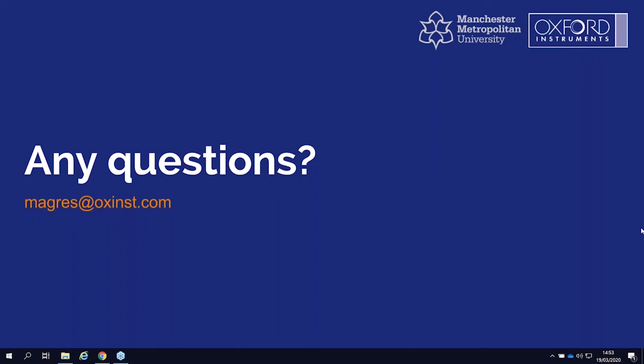So in order to give Daniel a full answer to his question, I don't actually know. I've only gone up as high as 10 mil per minute. I don't really know what the limit could be. I've not really wanted to push it beyond that. At 10 mil per minute, I was not unduly worried about going any higher. I had no real reason at that point to push it any more than that. So certainly something for me to go away and explore.